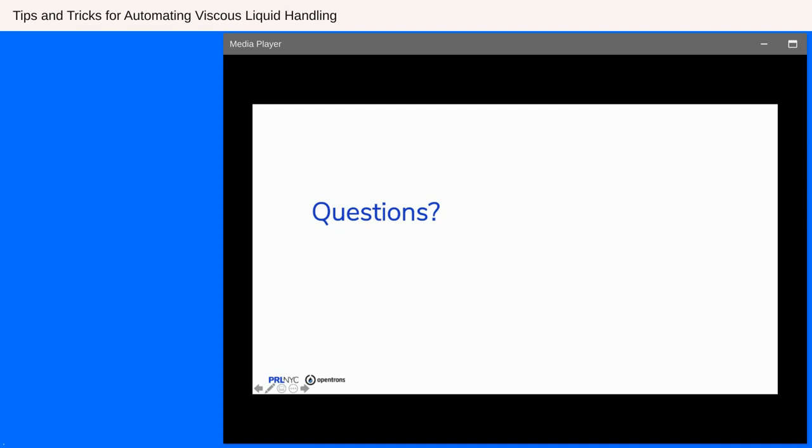Let's get started. Our first question is, could you elaborate on mixing viscous liquids?